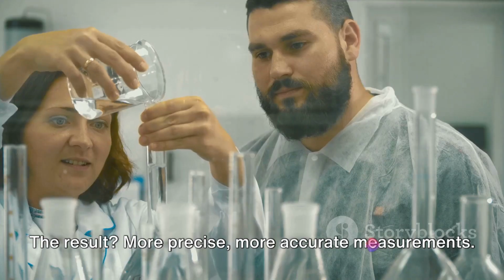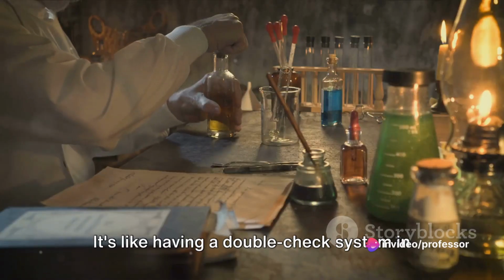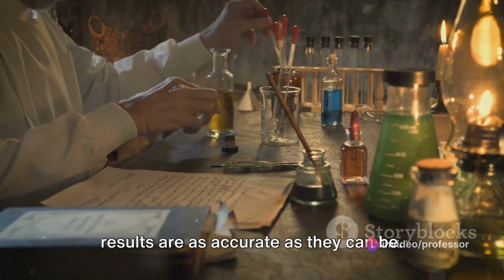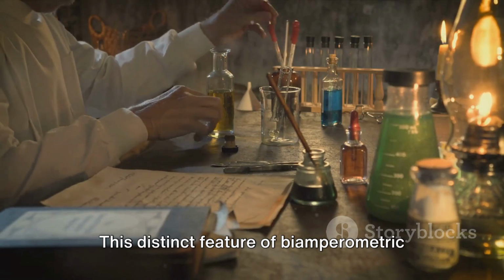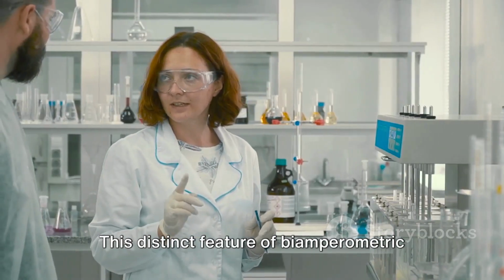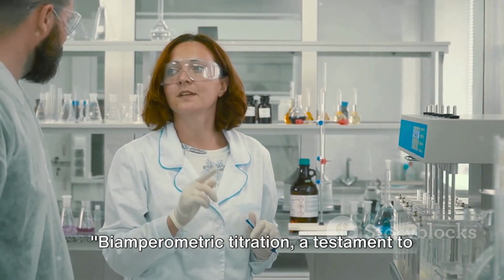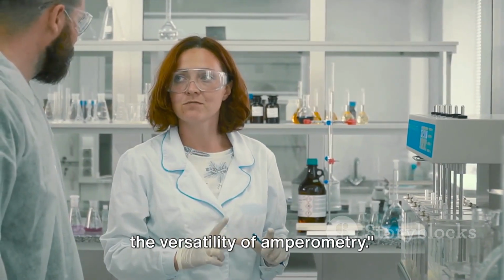The result? More precise, more accurate measurements. It's like having a double-check system in place, making sure that our titration results are as accurate as they can be. This distinct feature of biamperometric titration sets it apart from the rest. Biamperometric titration, a testament to the versatility of amperometry.